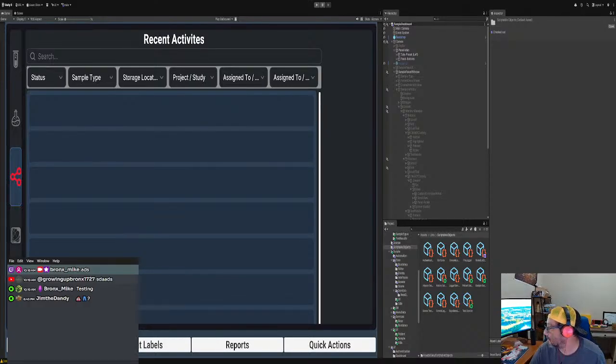All right. So let me see. Let me check something out first. We got two. We have two. And we have two. All right. So, and this is derived from the Bootstrap service asset, right? Correct? All right. So we built this up before in the previous videos.